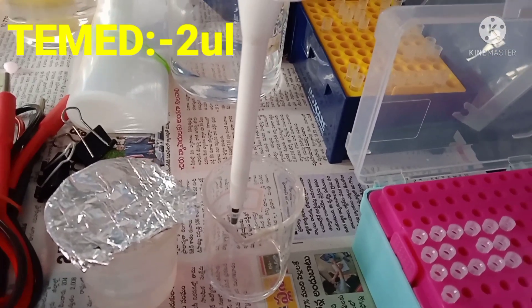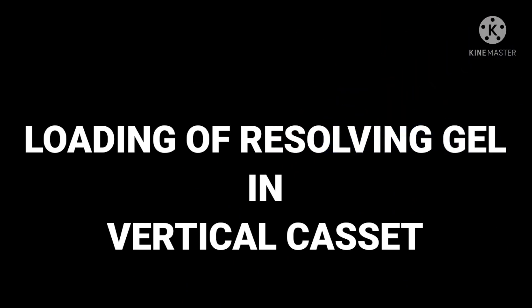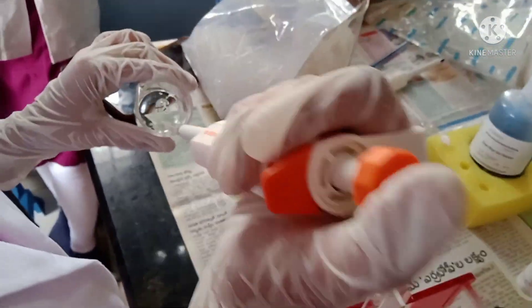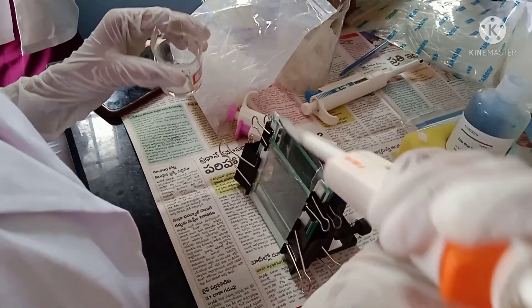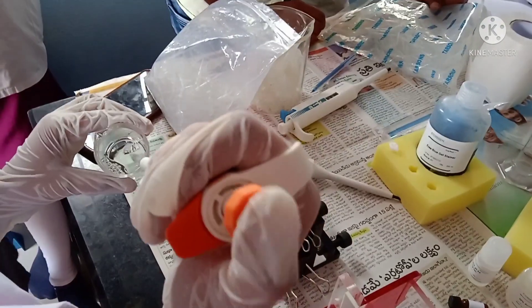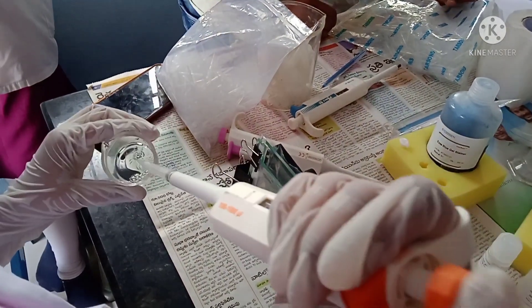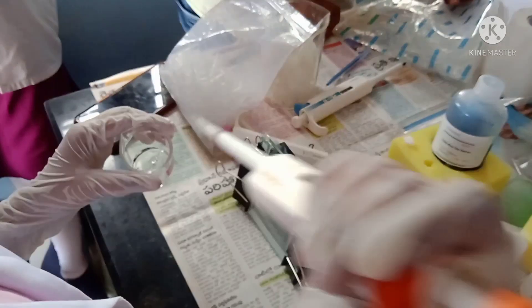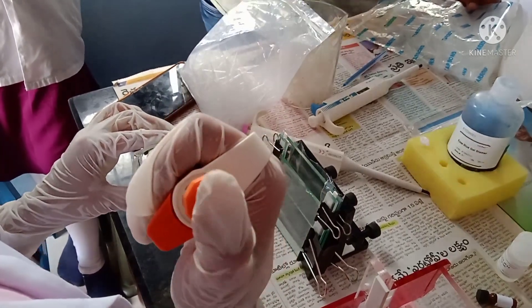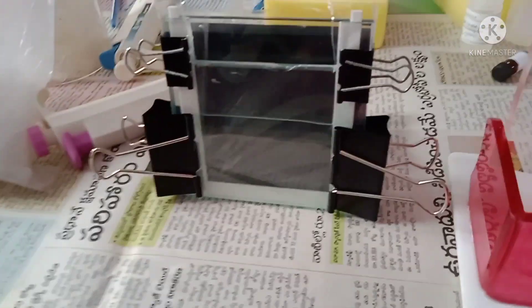By following this composition we prepare approximately 5 ml of resolving gel. Now let's load the resolving gel into the vertical glass cassette. Place the vertical glasses in an undisturbed manner and pour the resolving gel using a micropipette without forming any air bubbles, as air bubbles will disturb the passage of proteins through the gel. After filling, allow the gel to solidify by keeping it aside for a few minutes.